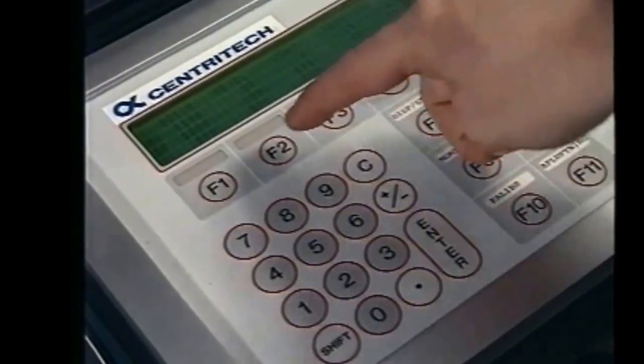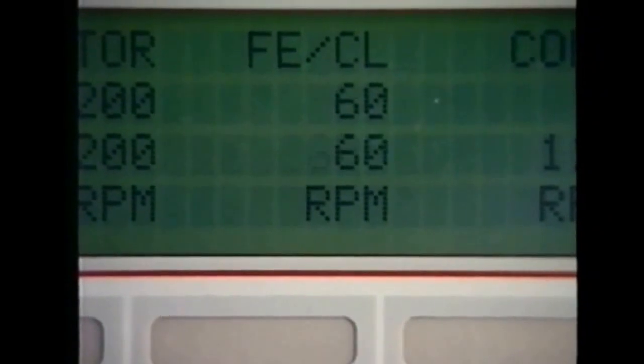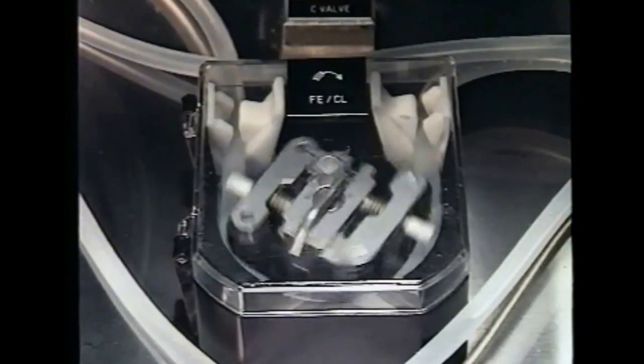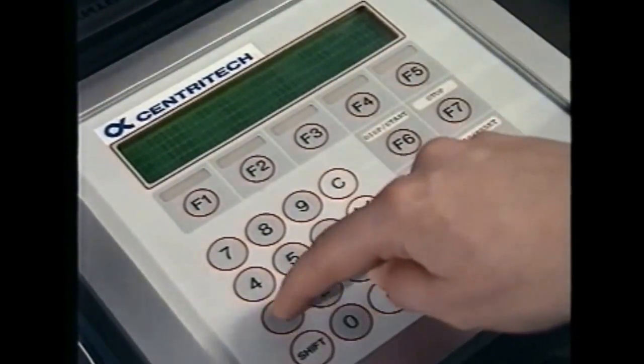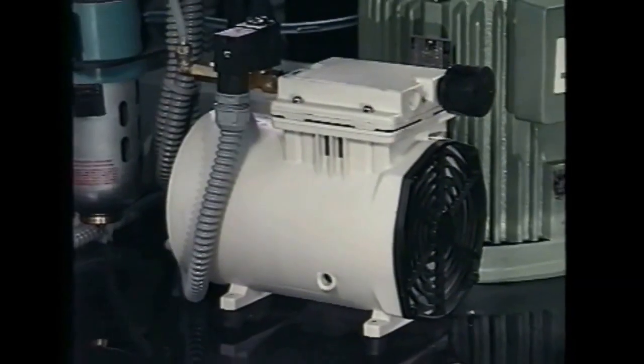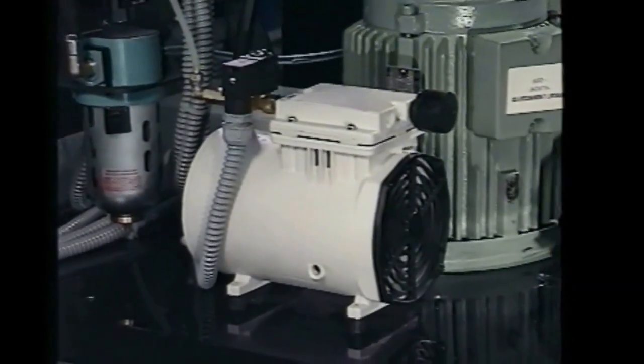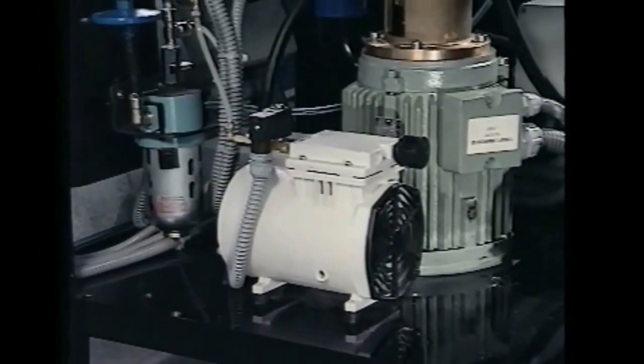The rotor speed is continuously variable. The flow rate is variable from 0.1 litres per hour to 100 litres per hour using the peristaltic pumps, and the separation temperature can be controlled using the built-in cooling system. An air compressor contained within the cabinet supplies the air required by the concentrate barrier and the tube valves.